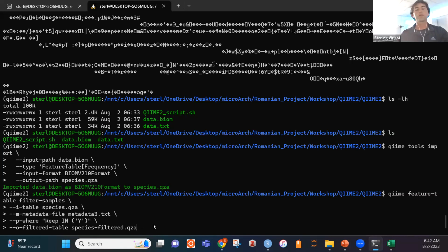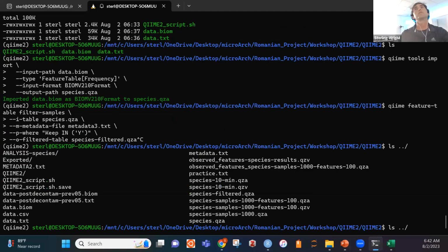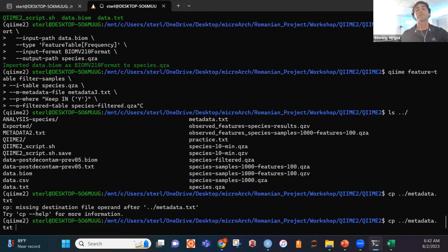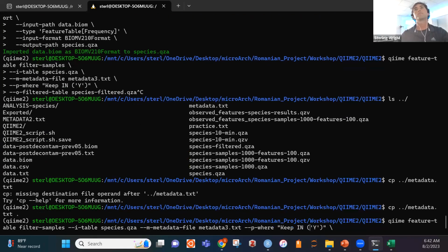I just realized though I did not copy my metadata file, and I also renamed it. So I'll have to copy this over here.